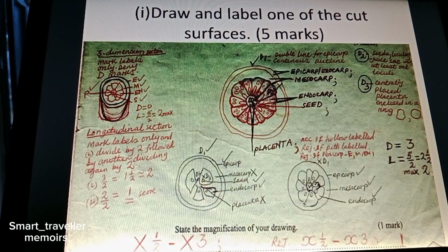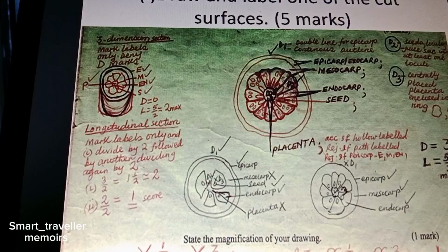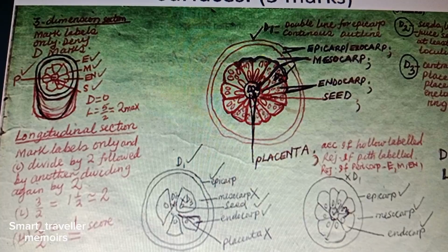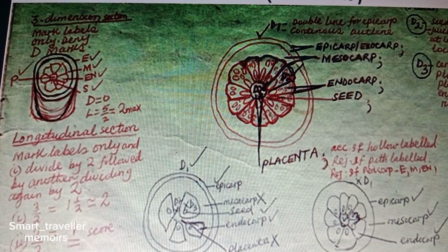Draw and label one of the cut surfaces, and you can see what we have done there. We have drawn. So let me focus on the drawing.